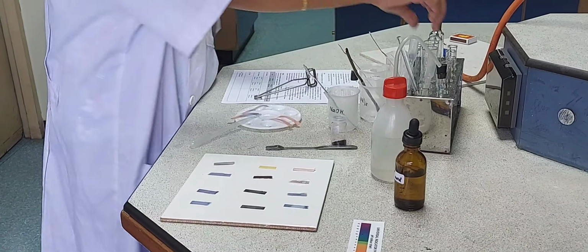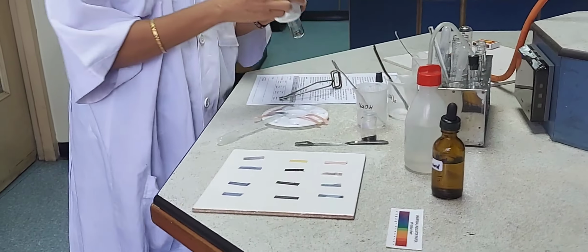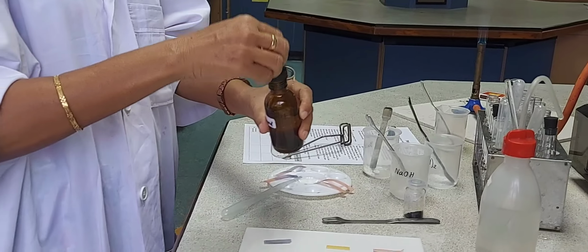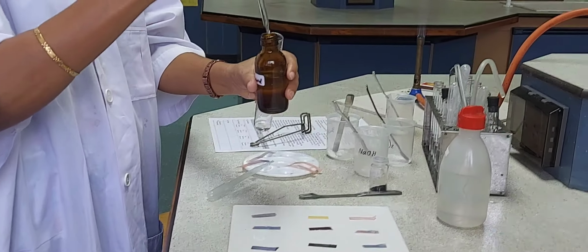Then I heated barium hydroxide. I will take 2 ml of the acid and then add the barium hydroxide.